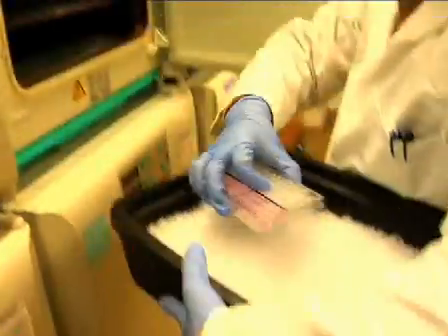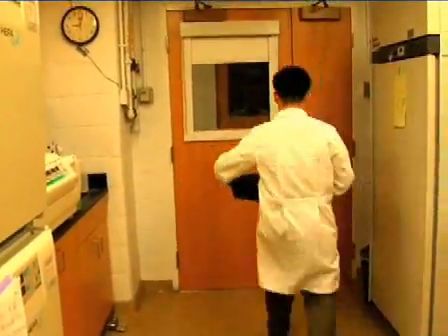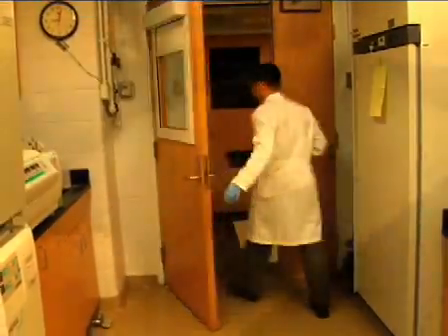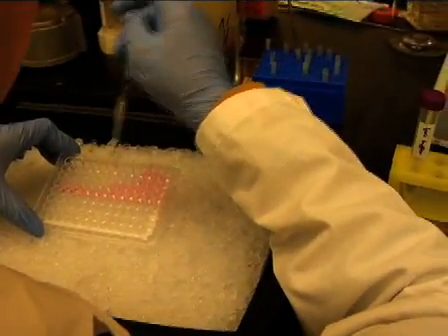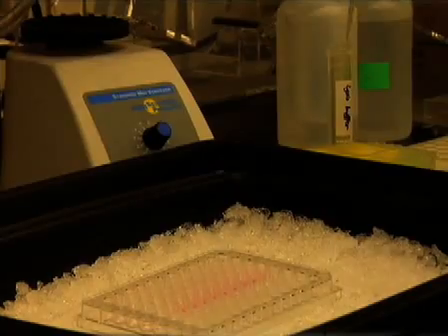Once the luciferase reagent is ready, remove the 96 well plate from the tissue culture incubator and place it on ice. Next, remove the media by aspiration. Then add 40 microliters per well of lysis buffer and leave the plate on ice for 30 minutes.